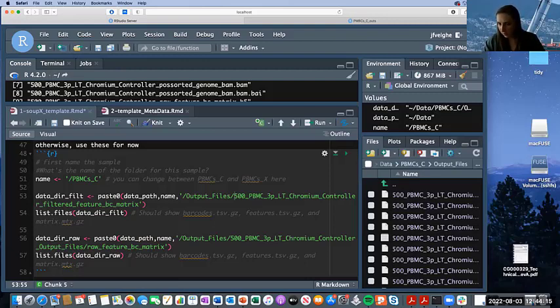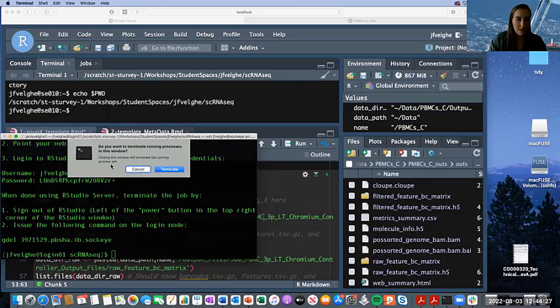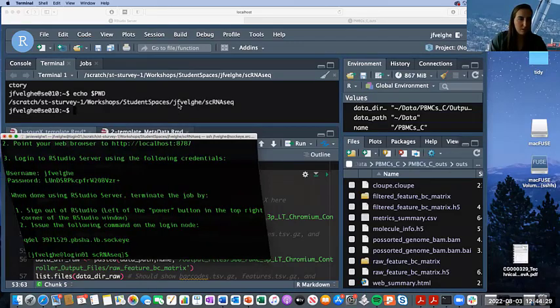All right. A new terminal. You haven't resumed yet. Okay. Where would you like me to go? Yeah, so you can run that tar, show them where to go. Yeah, and run the tar. Perfect. Okay. I'm just going to get rid of this.